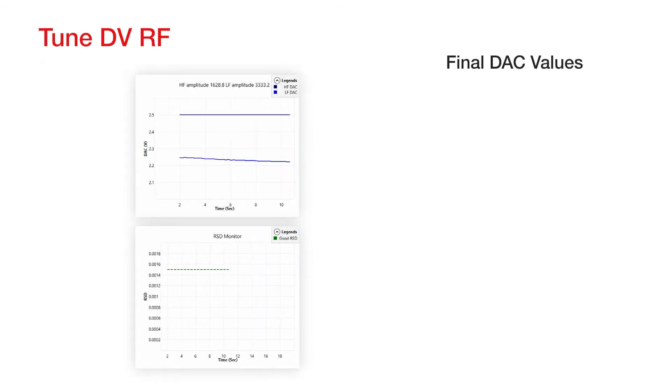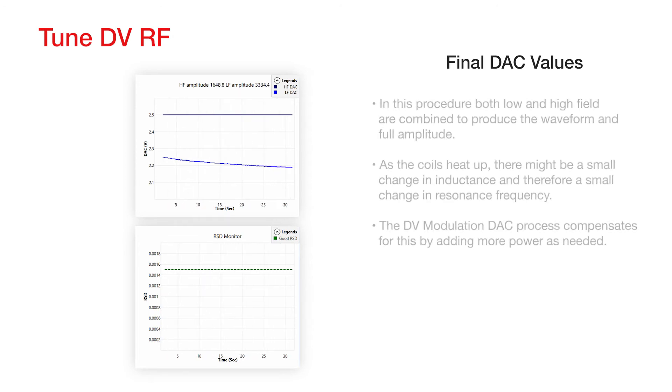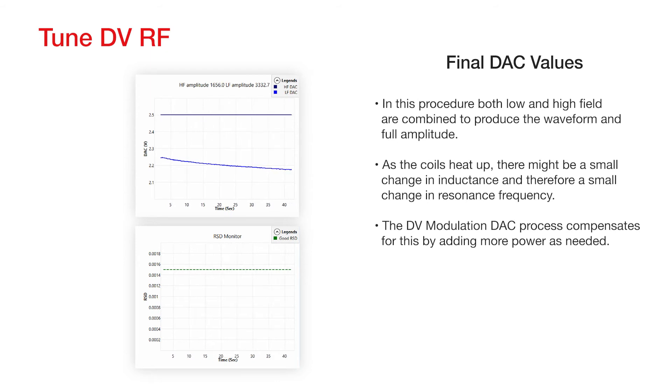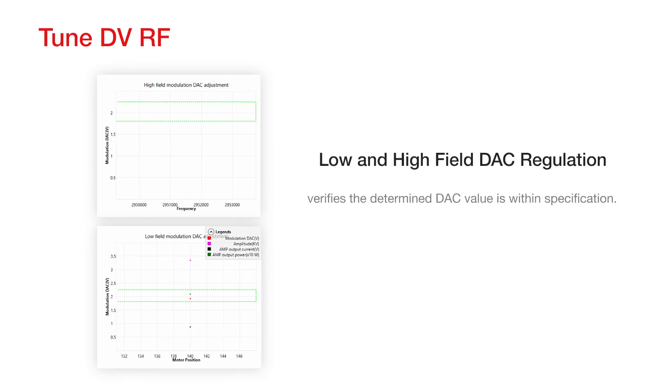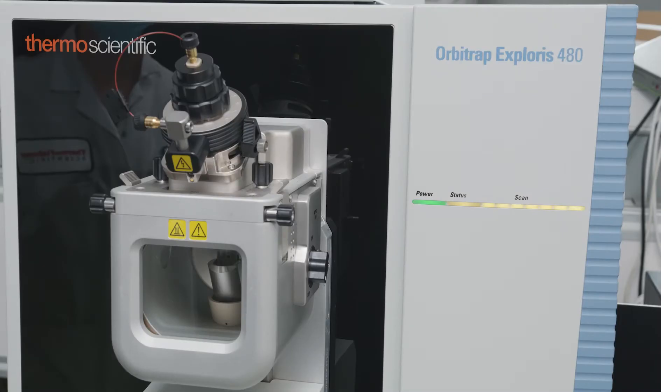Final DAC, digital-to-analog converter values for the amplitude, are determined to give the amplifier the set point. In this procedure, both low and high electrical fields are combined to produce the waveform in full amplitude. As the coils heat up, there might be a small change in inductance, and therefore a small change in resonance frequency. The DV modulation DAC process compensates for this by adding more power as needed. Low and high-field DAC regulation verifies the determined DAC value is within specification. The tuning process is now complete, and you're ready to run your MS with FAIMS.